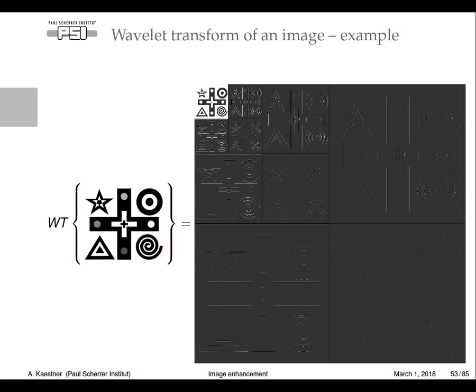And we'll see some example on the real data. Not noisy right now, but you can see here you have this input image, and the big ones are the detail images on scale 1, detail images scale 2, detail images scale 3, and the trend.